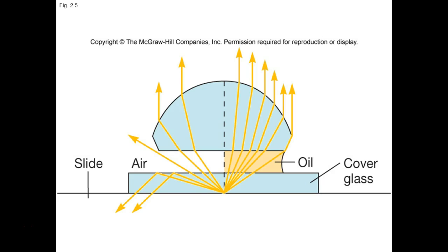But again, the whole purpose is to get that light where we need it to be able to visualize. And if we could do that with water, which isn't as messy as oil, that would be great. But you have to have special lenses for that.